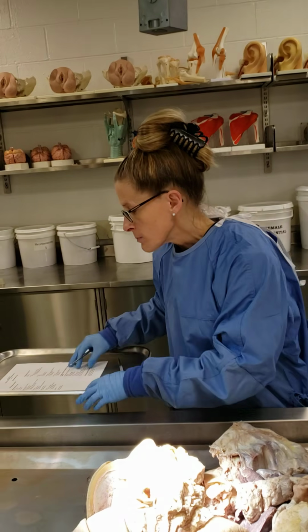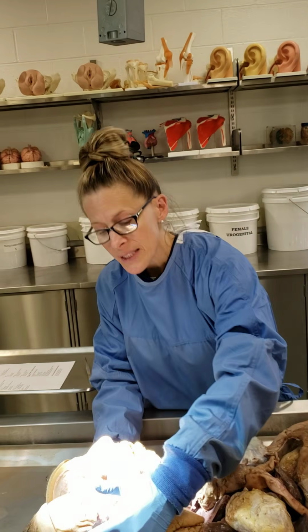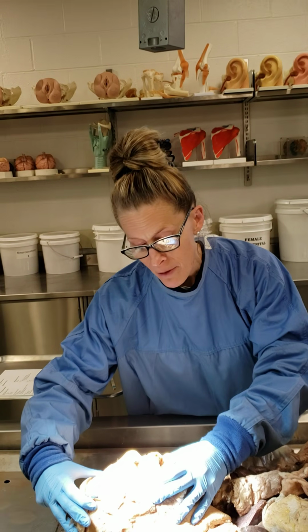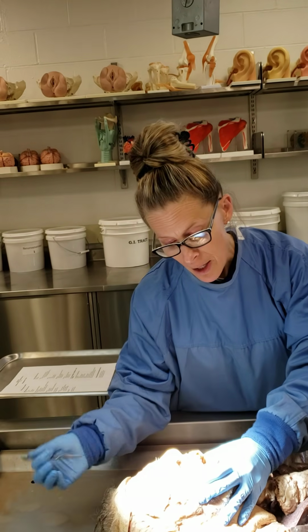So this is the first material that we'll cover after our midterm, and it focuses on the respiratory tract. As you can see, Dr. Joe and I performed a mid-sagittal section of Jenny over the break.